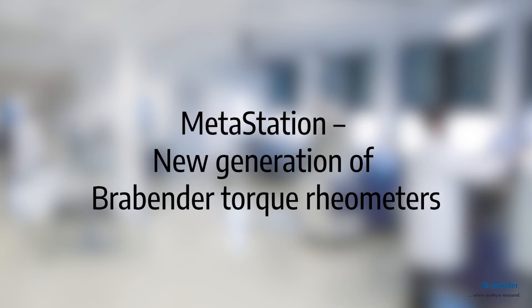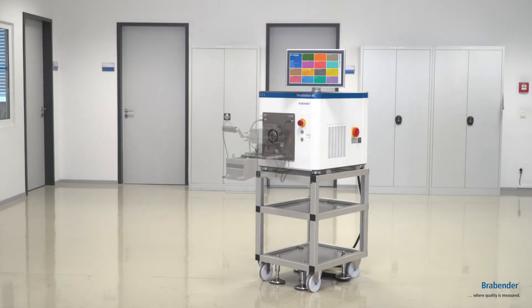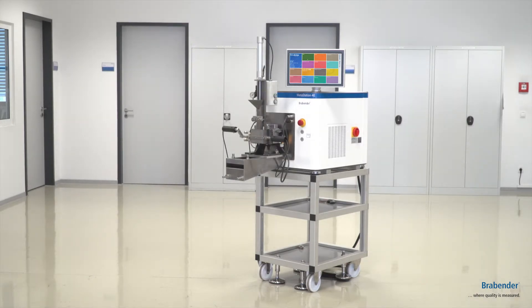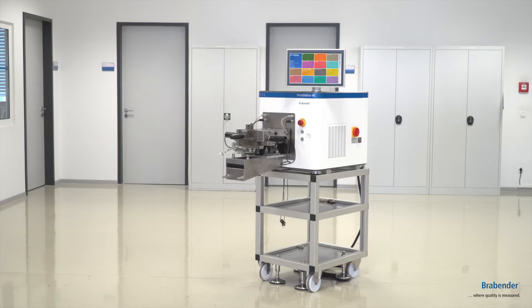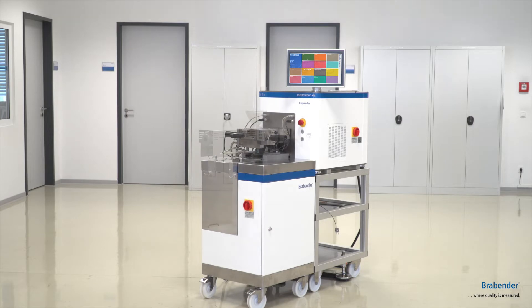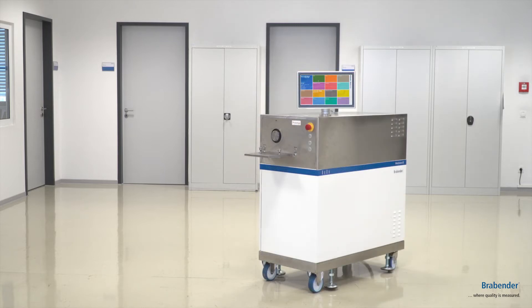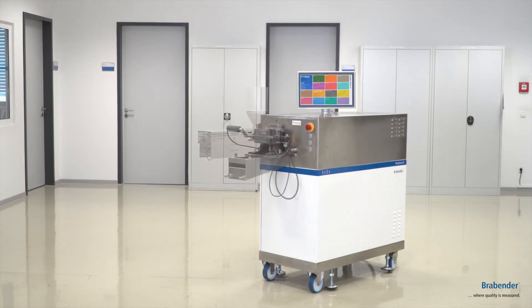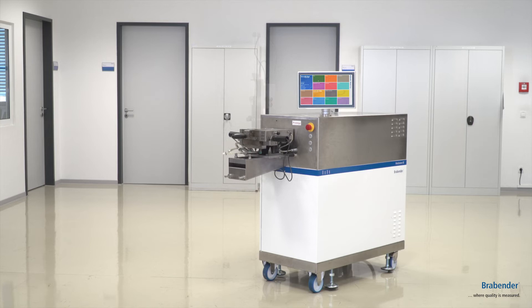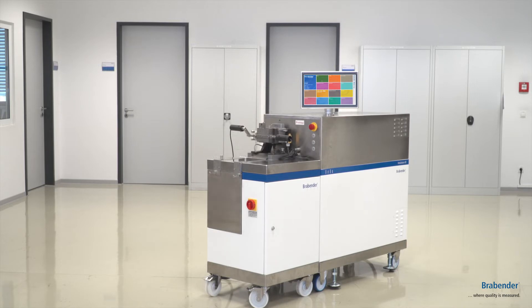We want to introduce our new drive generations, the Metastations. Here, as an example, our smallest one, the Metastation 4E, where you have the opportunity to attach our smallest devices such as our 30 or 50 mixers or our 1925 single screw extruders. Of course we also have bigger drive units like the Metastation 8E or 16. The number stands for the power the drive generation has, so here the Metastation 8E with 8 kilowatts power, which leads to much higher torque levels and drive speeds.